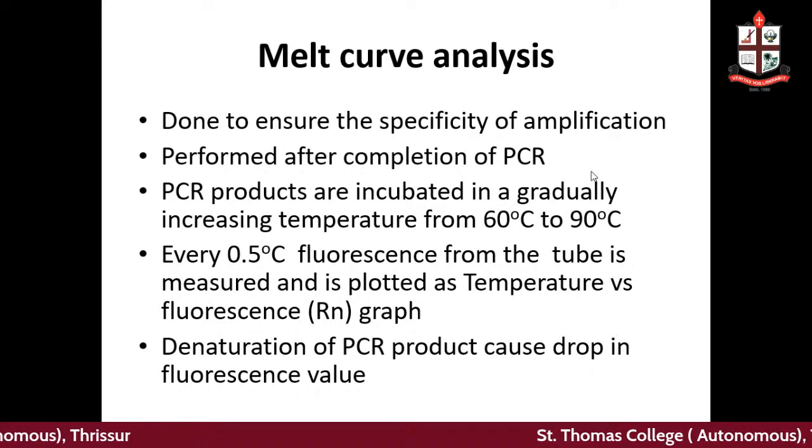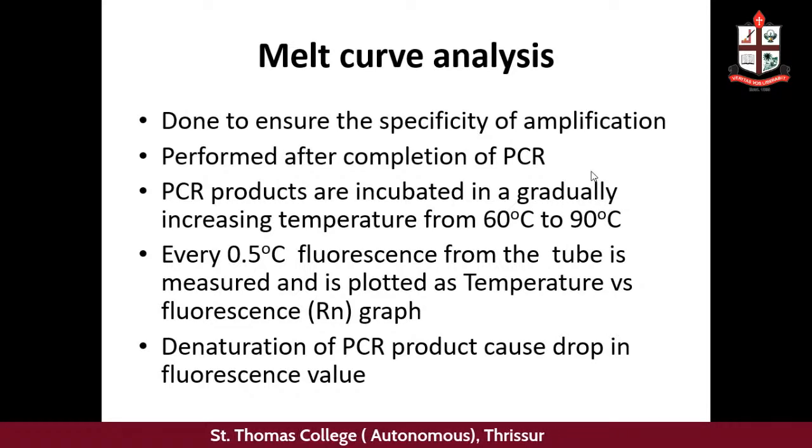So this analysis helps ensure the specificity of the amplification, that is, there is only the intended PCR product, with no primer dimers and non-specific amplifications.